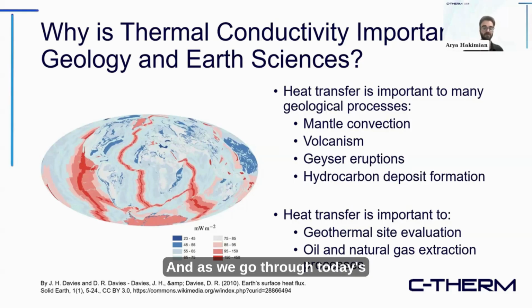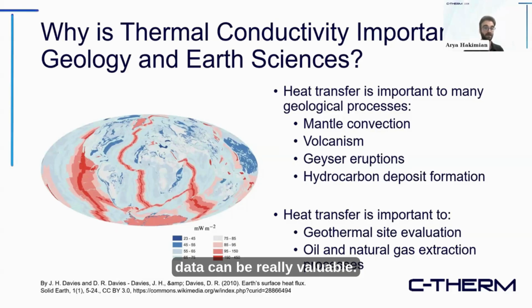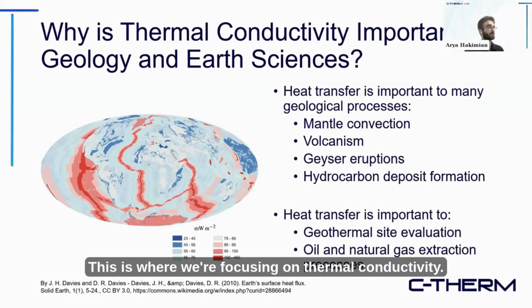As we go through today's application list, we'll see a few different examples really highlighting where that thermal conductivity data can be really valuable. So all under the guise of heat transfer, this is where we're focusing on thermal conductivity.